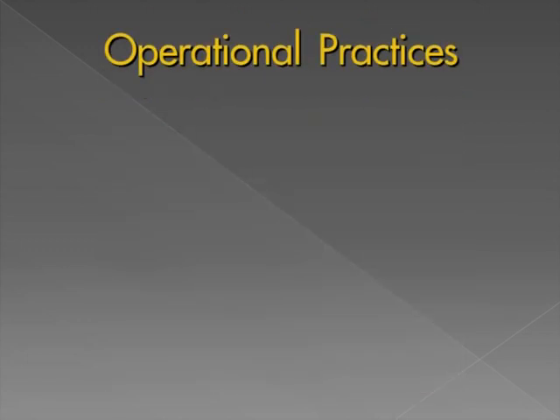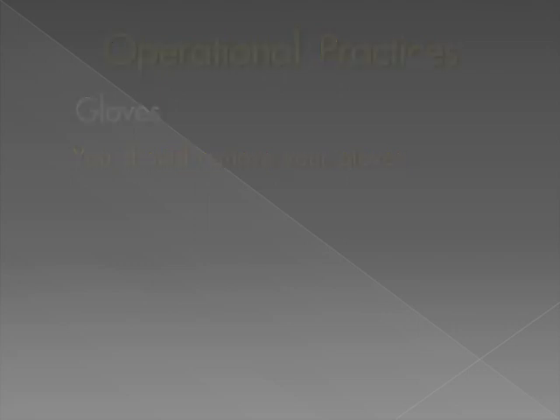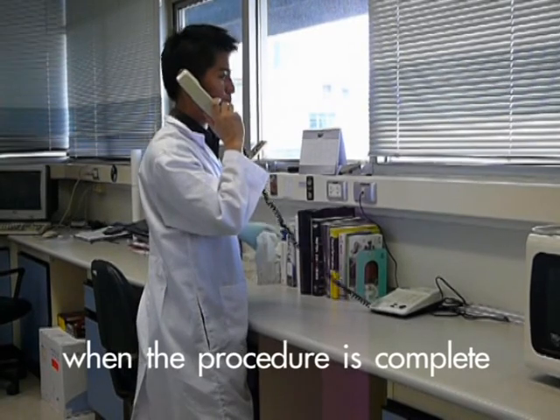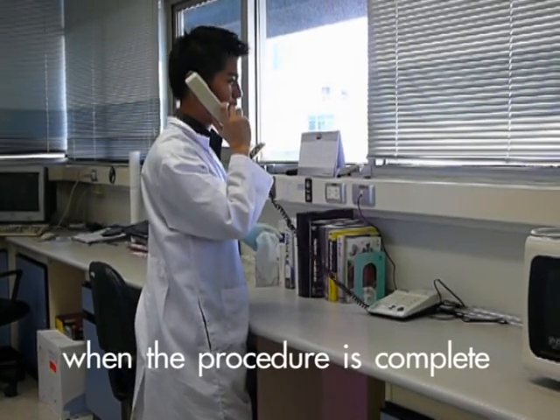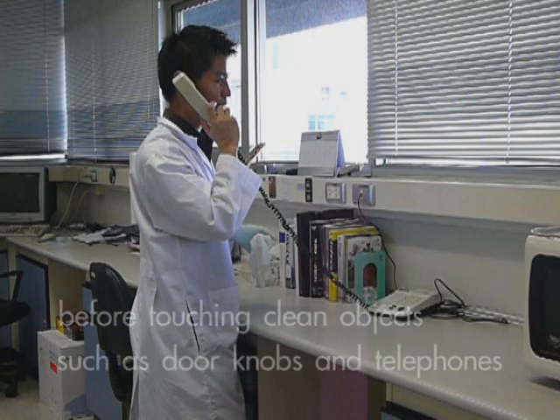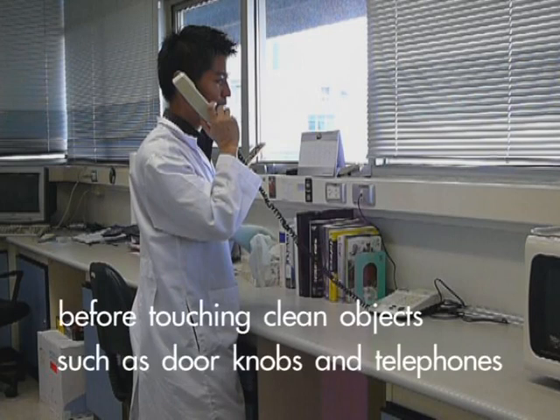Operational practices. Gloves. The correct use of gloves will prevent the spread of infection. You should remove your gloves when a procedure has been completed, if the glove is torn, and before touching clean objects such as doorknobs and telephones.